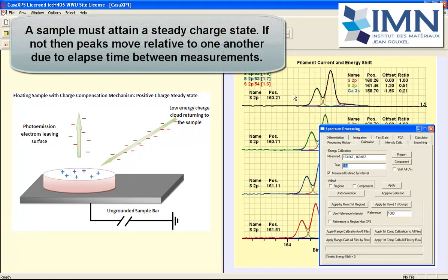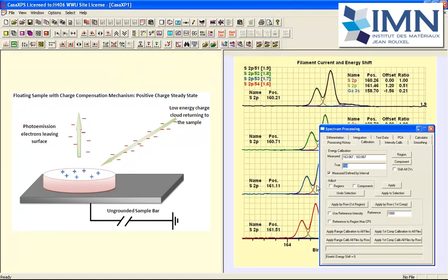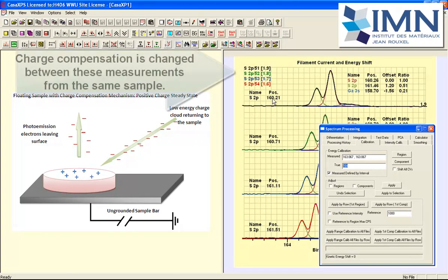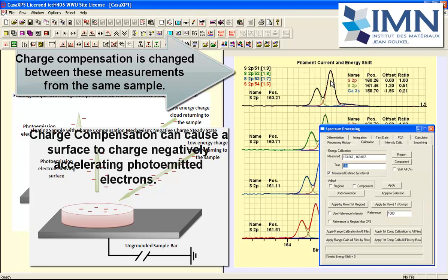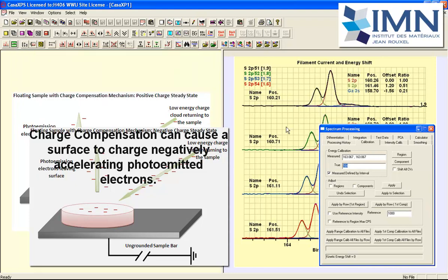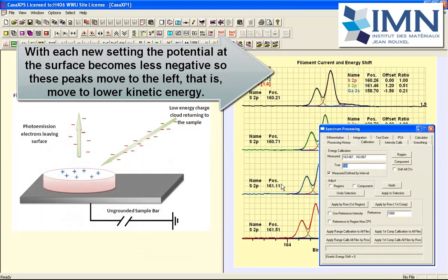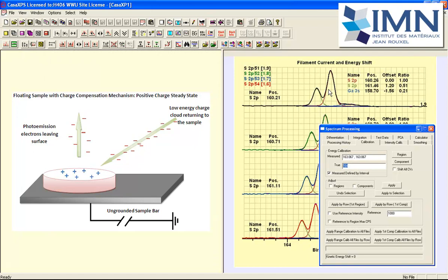Now these spectra have been measured using different charge compensation states and you can see simply by looking down this list here that the position for this sulfur 2p peak is changing with each different setting for the charge compensation.